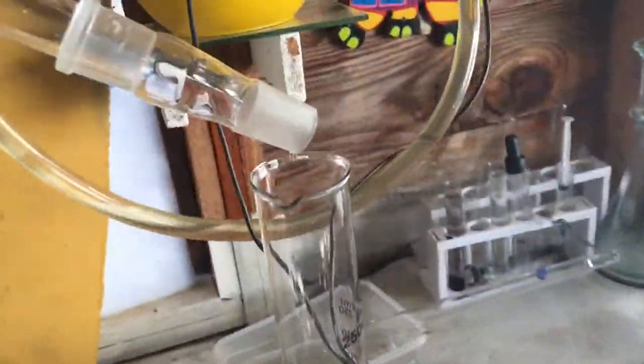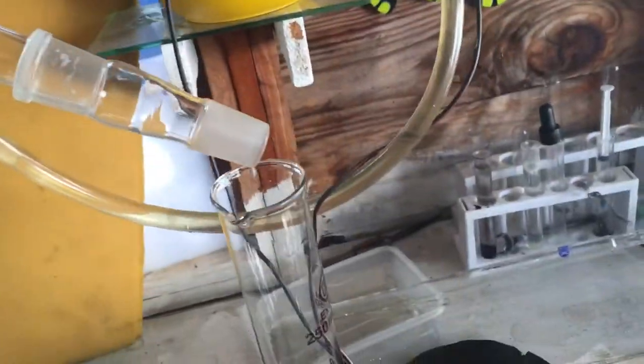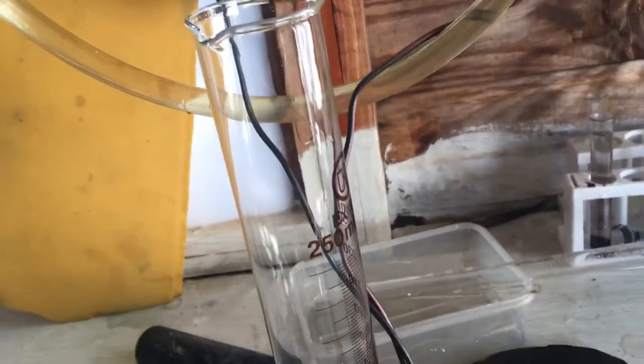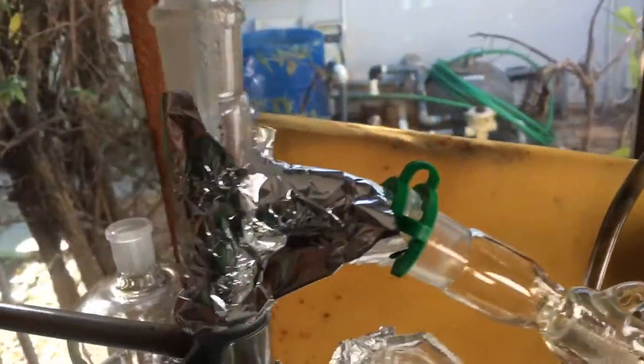I measured 500ml of alcohol to get a calculation of 120ml of ethanol. This is the distillate here — as you can see, it's already condensing. The temperature is around 90°C. Normally ethanol boils at 78°C, but I think this is because it's mixed with water.